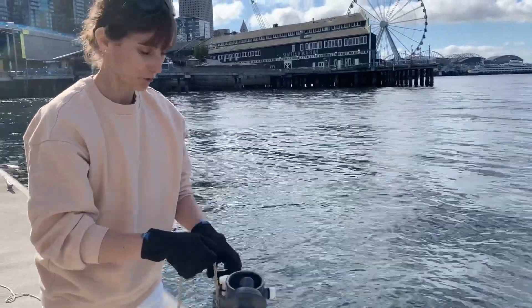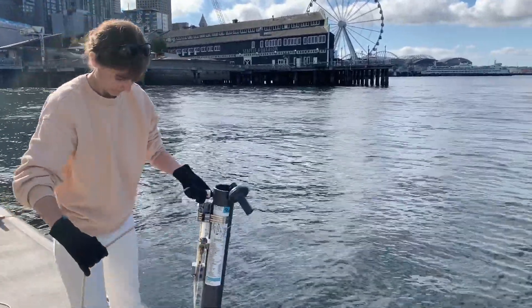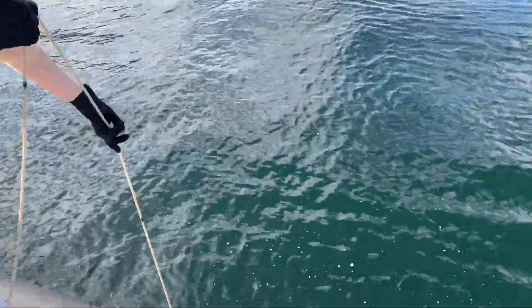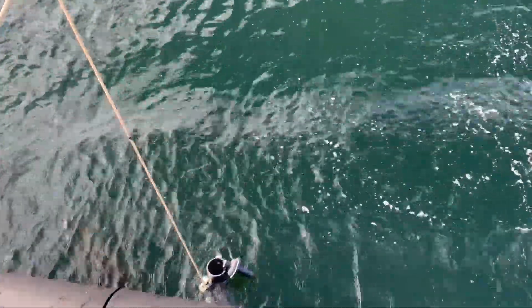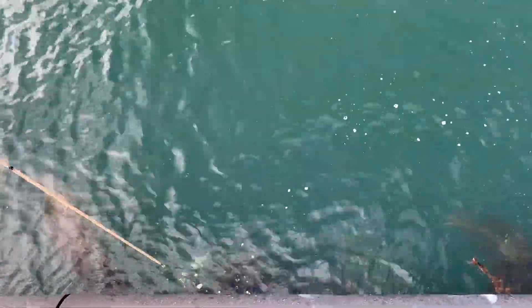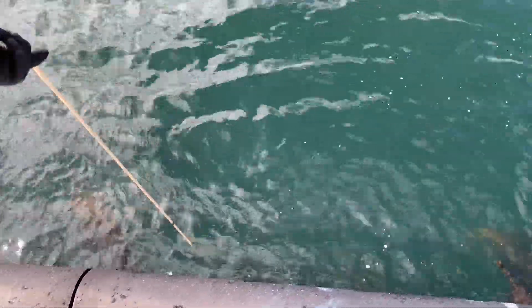I'm going to send it down to five meters. Okay, so now it's right at the surface — if we wanted a sample of surface seawater we could close it now — but we are going to go down to five meters. I'm going to lower it down. There's the first mark right at the water surface, so now it's at one meter. There's two, three, four, five meters, depending on the waves.